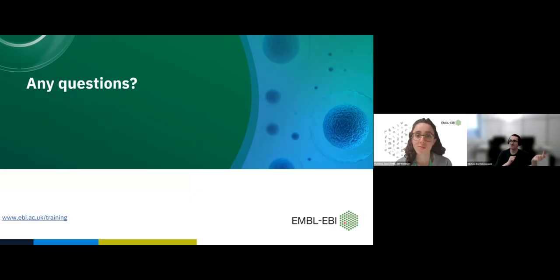There, the question becomes a bit more one of performance in reading with Zarr compared to reading with H5AD, but that depends a bit more on the specific use case.